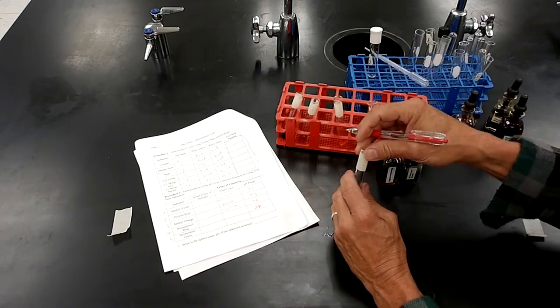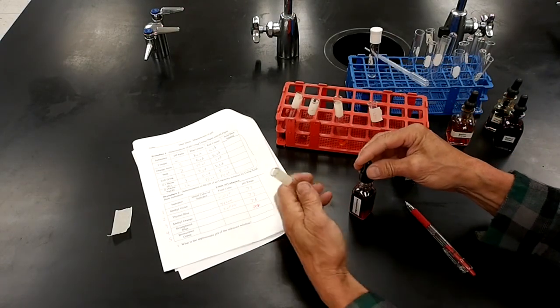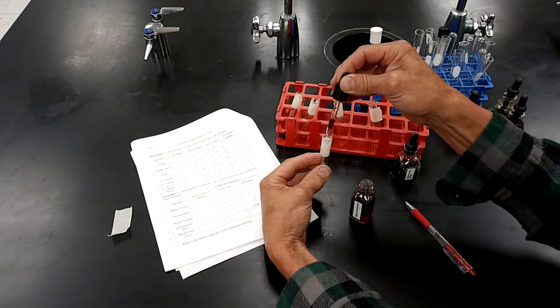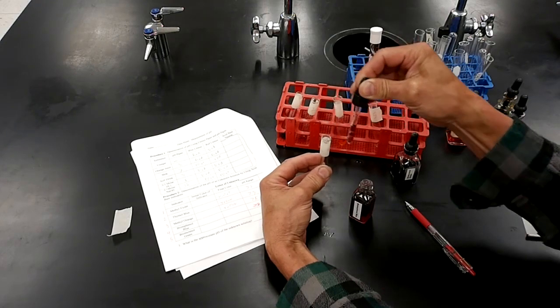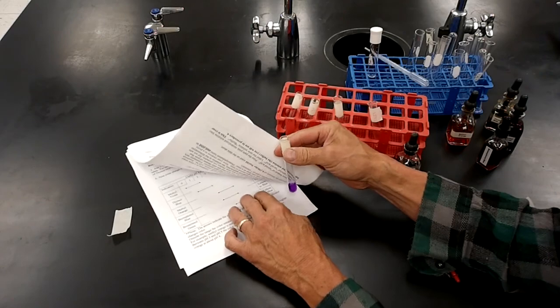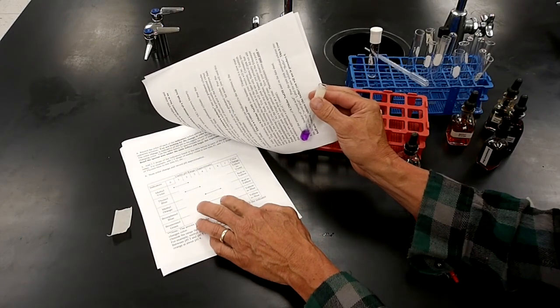Tube 4, bromphenol blue. Add it to my unknown. Oh, this dropper's pretty bad. That's kind of pretty. Yellow if it's below 4.